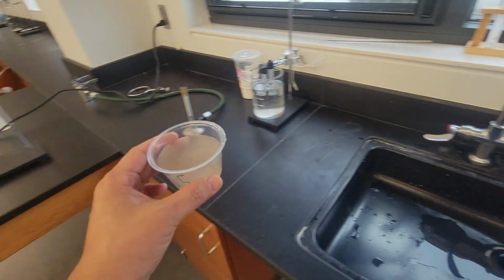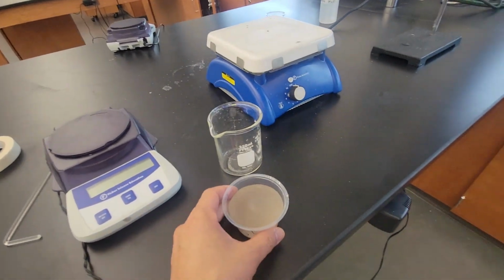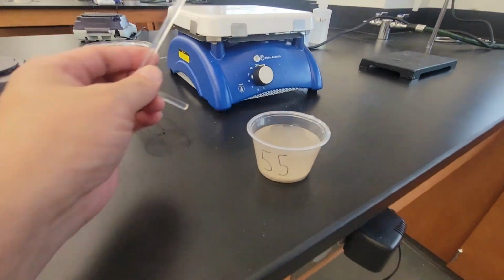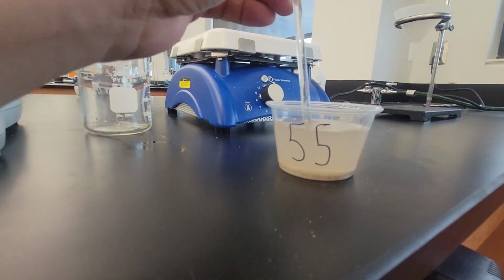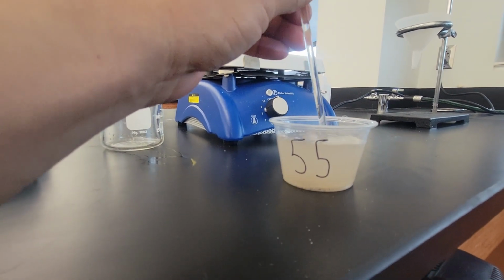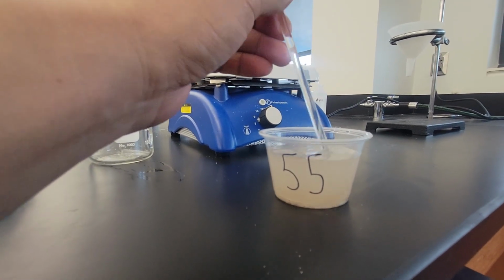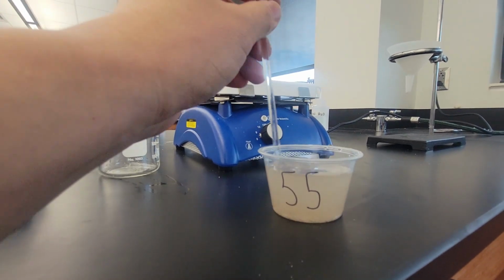All right, but I don't know how much salt's in here, so we'll just put enough water to dissolve the salt. That's important, that you add enough water to dissolve all the salt. Now if you add a ridiculous amount, then you're going to waste time later, as you'll see, but it's important that you add enough water to dissolve all the salt.